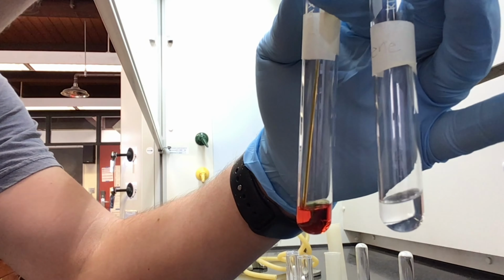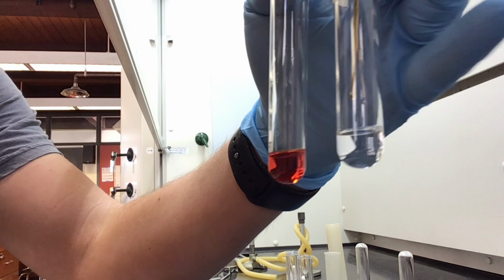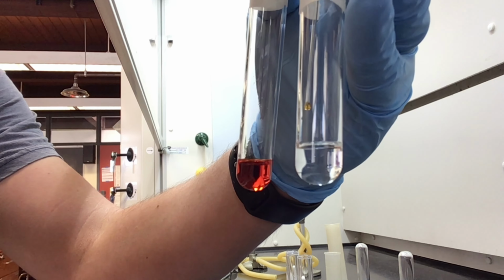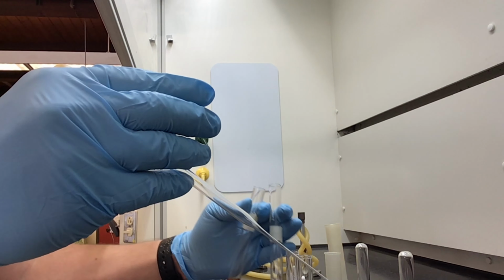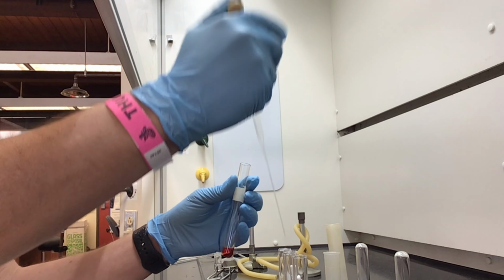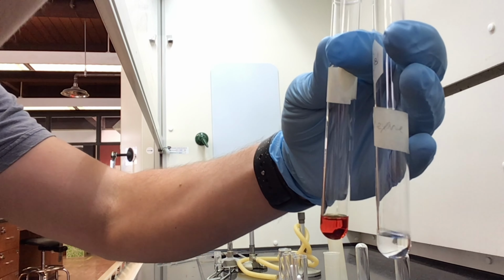Okay, so here's the thing. You want to add slowly, and then you might want to just keep adding and see what happens. Maybe it'll eventually stay colored, and that just kind of means that you consumed all of the alkene, right? If you add 5, of course, like I mentioned, then it's pretty solid confirmation that you have an unsaturated compound that's reacting with the bromine. So let's move on, and that's a positive, right? That's a positive result.